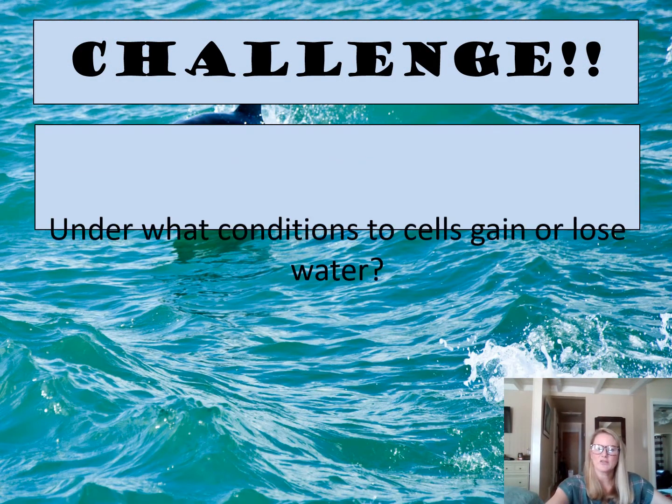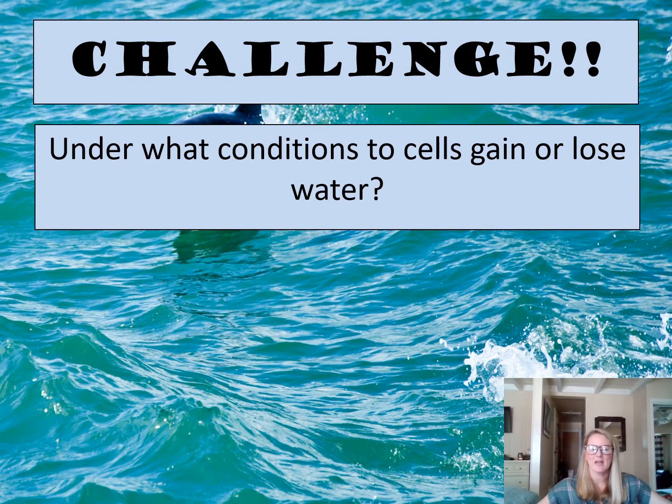So the challenge for this week's lab is: under what conditions do cells gain or lose water? You're going to be subjecting different cells to solutions and you're going to see whether or not they will gain or lose water, or maybe nothing at all.